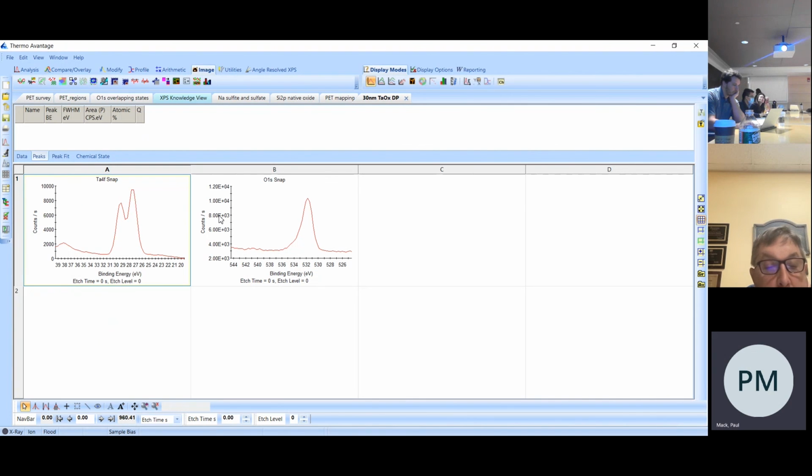So you have spectra either in an XY direction, or with depth profiles in the Z direction, going down into the surface. So the actual processing you use is quite similar, even though of course you end up with different looking results at the end.